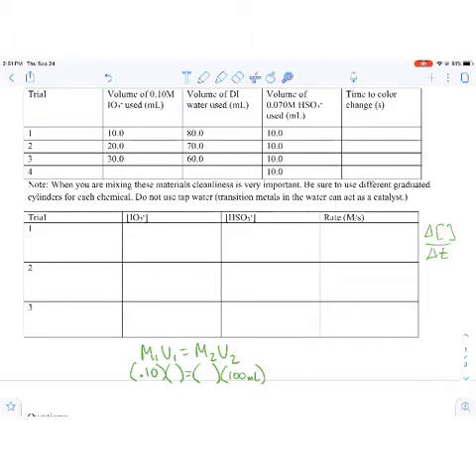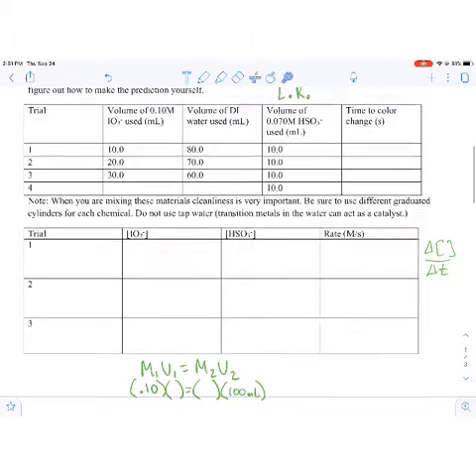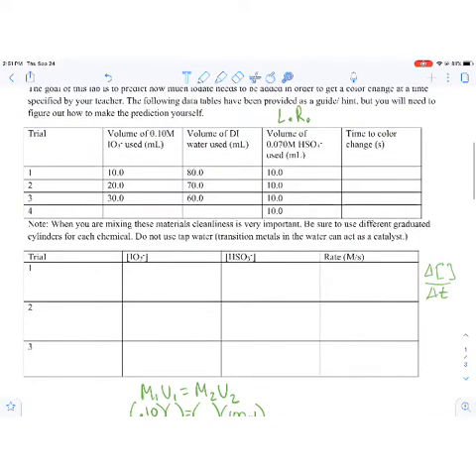But for now, let's go ahead and switch over to the video camera and we will get to timing, etc. So you're going to want to make sure you've got something that you can use as a stopwatch. I'm going to let you guys do the timing here. So let's get to it.